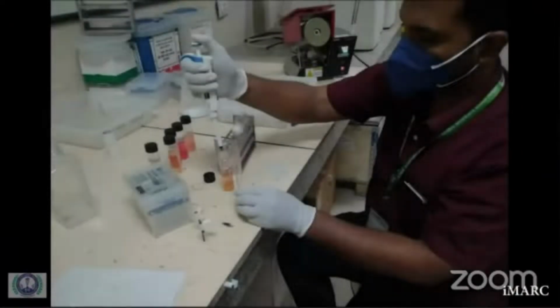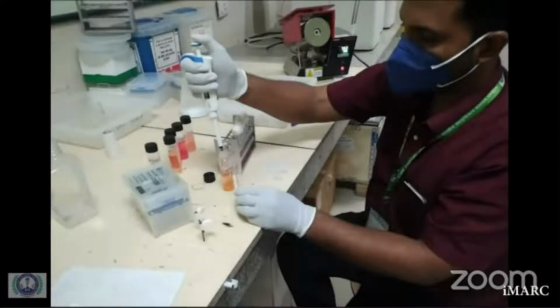Sugar fermentation. Liquid fermentation media: filter sterilized sugar at 2% concentration is added to this. This is taken in the volume of 5 ml and a sterile Durham's tube is put into each tube. And a heavy inoculum is prepared from a media which is sugar free. Hence, we may remember that nutrient agar can be used for subculturing the isolates for the sugar fermentation test.